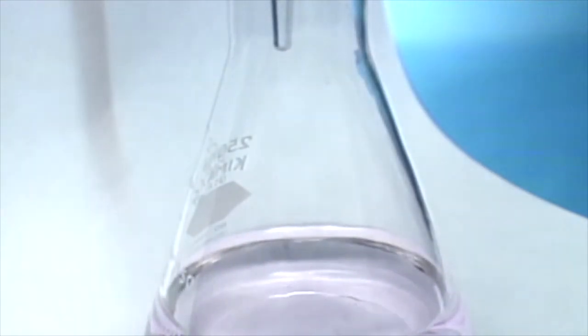Wash down the sides of the flask to be sure that all the titrant that has been released from the burette is in the liquid sample.